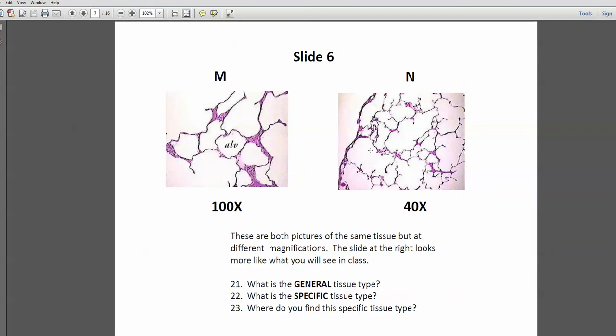Slide 6. This tissue is taken from the lungs. We've got lots of free spaces. If you look hard, you'll see there are lots of little nuclei. So if we've got free spaces and lots of nuclei beside one another, we know it's epithelial tissue. And if you look, what you're looking at here are flat cells surrounding these free spaces. And there are single layers of flat cells. This is simple squamous epithelial tissue. Specifically, what you're looking at is air sacs. And the walls of the air sacs are composed of the simple squamous epithelial tissue.